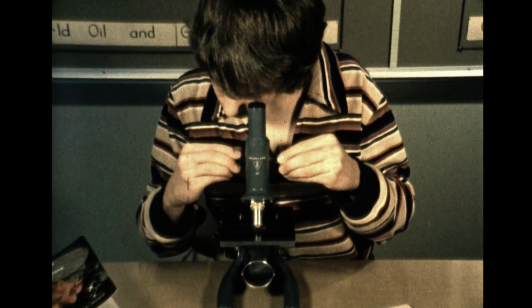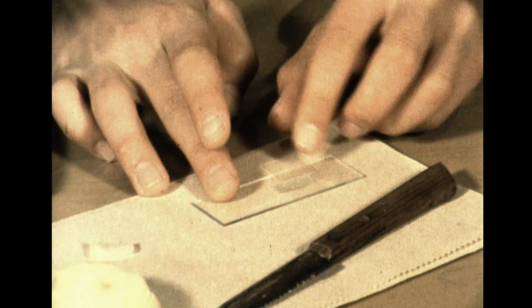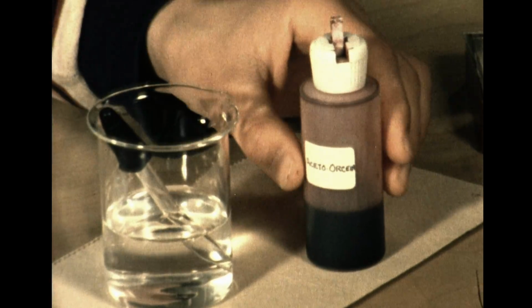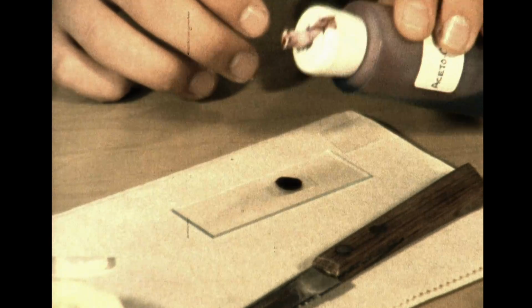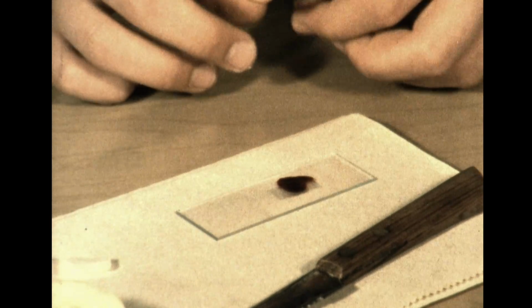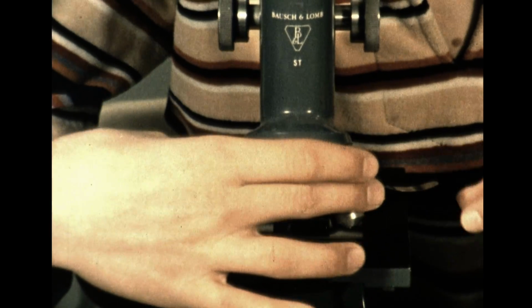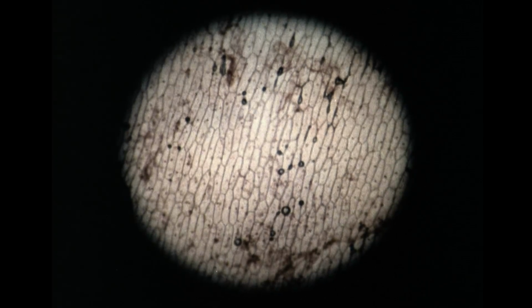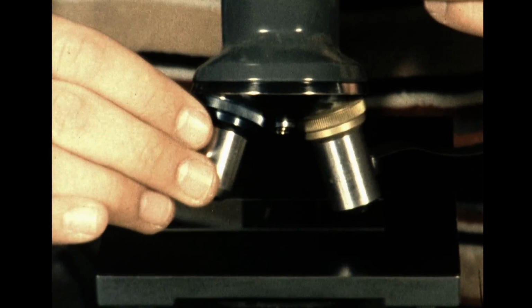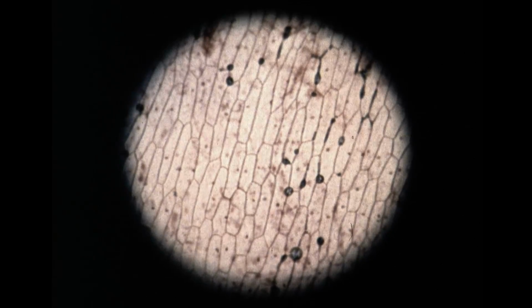The low magnification of the sample clearly shows the cell structure. There is a way of improving the image of transparent objects, and it is called staining. Cells are treated with dyes that are selected for certain sample components. A drop of acetorcein is applied to the onion epidermis. Looks more interesting now, doesn't it? The nuclei in the center of the cells become visible. A larger magnification of the stained onion epidermis. Now the cell nuclei are clearly visible.